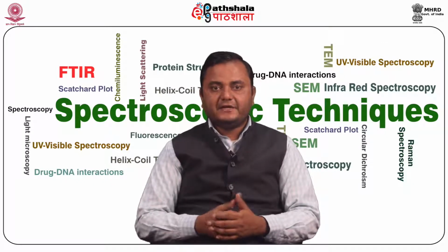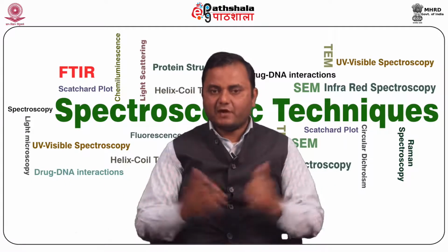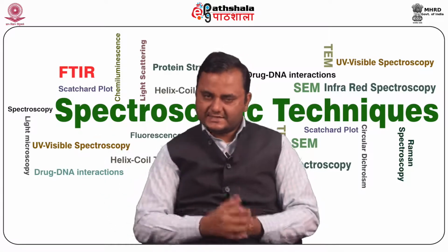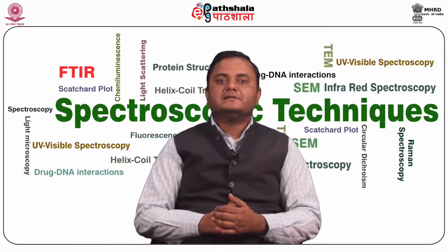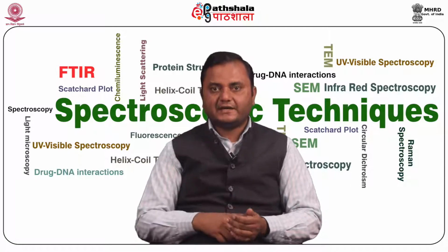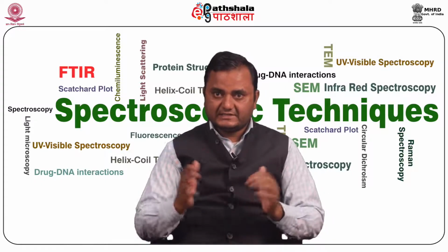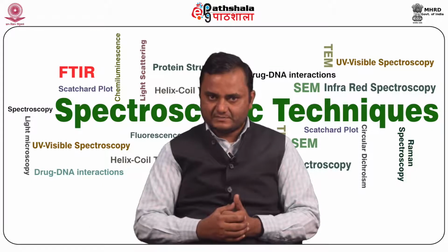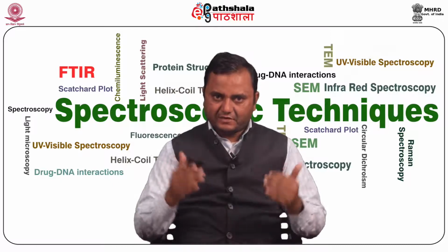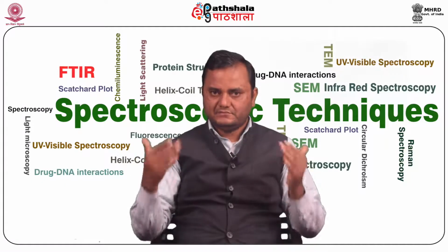Theoretically, an infinitely long scan would average out all the noise of the baseline. However, it is not possible, but it can be theoretically done. That's why we focus on increasing the number of scans as much as we can. The dispersive instrument collects data one wavelength at a time and collects only a single spectrum, and there is no good method for increasing the signal to noise ratio in the dispersive spectrum. However, with the FTIR coupled interferometer system, we get very high data quality with an improved signal to noise ratio.